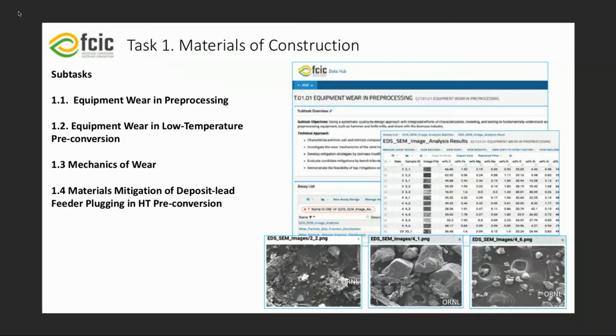There's the nice thumbnail capability that you're all aware of. And you can associate the images with their chemical composition and see that these are mostly silicon, they're little pebbles, but over here we've got some biomass, which is mostly carbon and so forth.